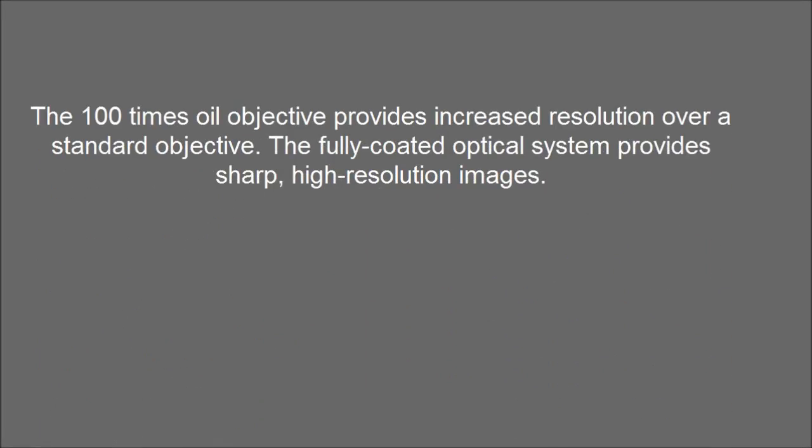The 100x oil objective provides increased resolution over a standard objective. The fully coated optical system provides sharp, high-resolution images.